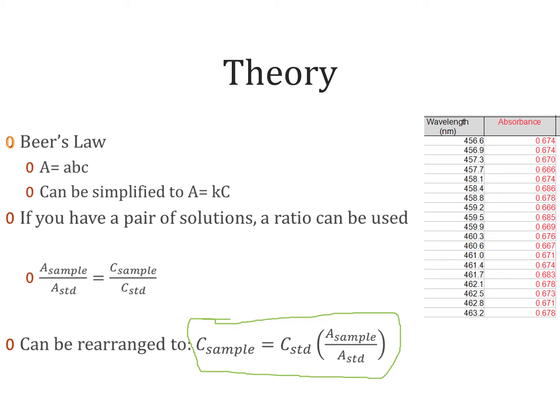And just to give you, these values were generated and you can find them in LoggerPro, and the files will give you a table like this and a spectrum. But just to give you how to find the exact value of the concentration that you need, you want to look at the wavelength of 460 nanometers.